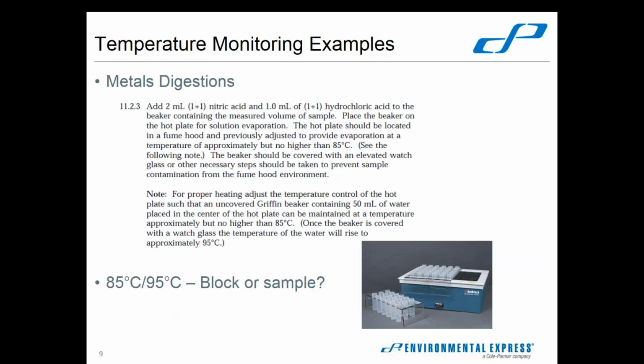And so what temperature do you set your block at in this case? Well, the answer there is not 85 degrees. Because, without getting into all of the physics of heat transfer, if you took your thermodynamics class back in college, you may be having some nightmare flashbacks now. But anytime you transfer heat between two different media, you get some heat loss.